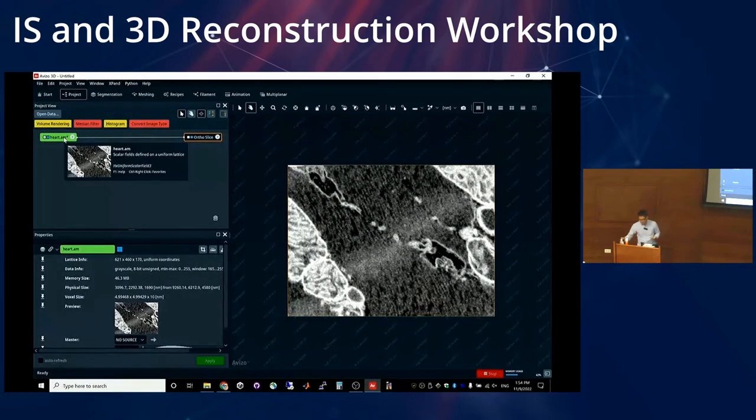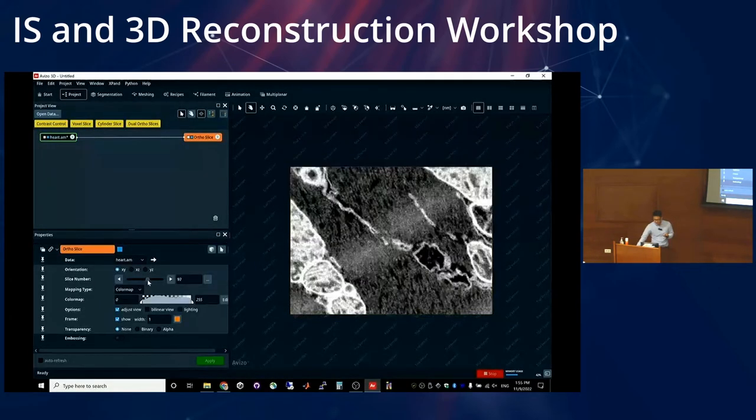So, is there anyone who's an expert in this field? Good. I'm not an expert in this field, but I'm just going to base what we're going to do today on the Avizo tutorial. The objects or materials that we want to segment here are these bright regions, which is apparently mitochondria. Then you have this dark, stripy region, and this blurry region here, and the dark regions there. So we have 1, 2, 3, 4. Okay, now let me show you the different slices.